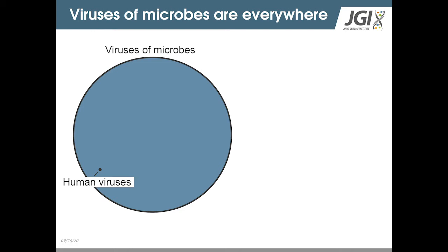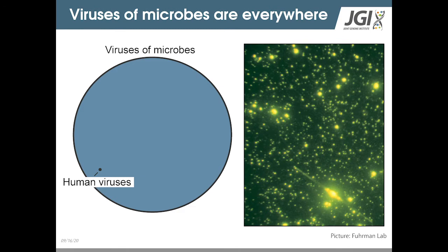If you want a visual, not even representation, but an actual view of viruses, this is what we typically show. So what this picture is, one drop of seawater concentrated and stained with SYBR Green. SYBR Green stains DNA, so you will have microbes coming up as big blobs like this, and that's an interesting eukaryotic microbe here, you see elongated. All the small dots behind, all these things here, which are regular small dots, these are viruses. So basically, this drop of seawater is just like microbes floating into a sea of viruses everywhere.